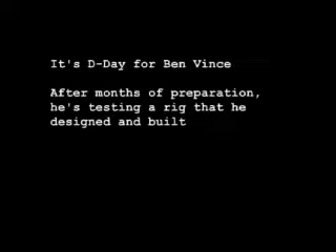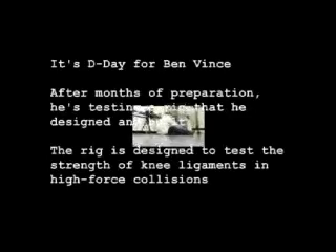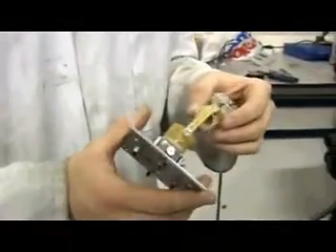World, the time has come to push the button. My finger is on the button. This is the first time I'm actually going to use the rig for a test, so we're going to put this artificial ligament in and see if we can get some results and see if the rig actually works.